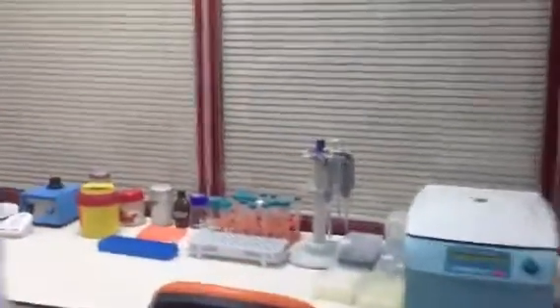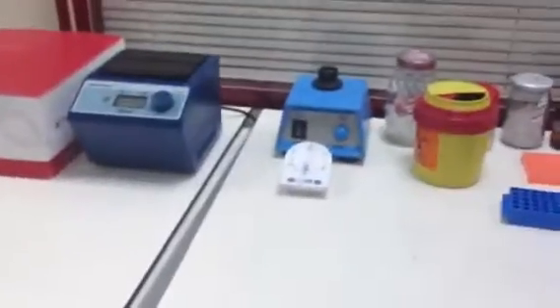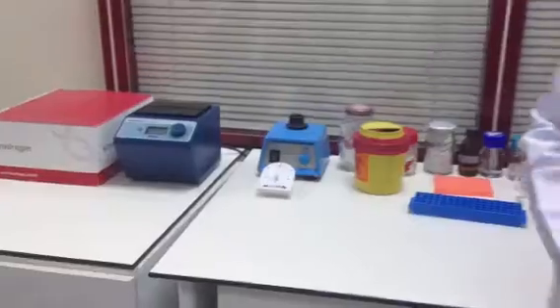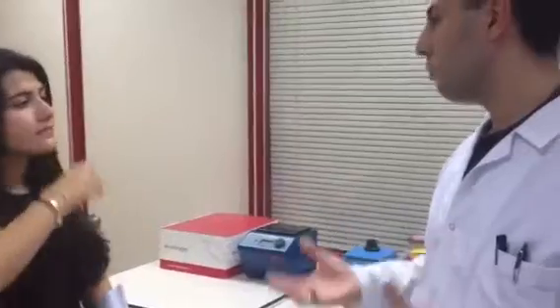A centrifuge, and heat blocks, and a timer, a lot of machines for RFLP. And the RFLP technique is very hard because we use a lot of machines and a lot of techniques for Mycobacterium tuberculosis types.